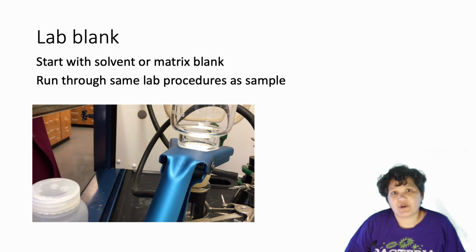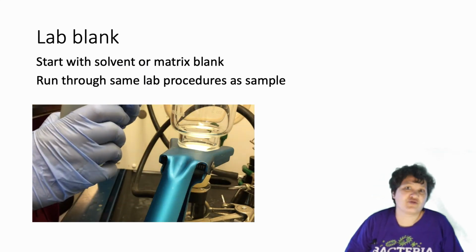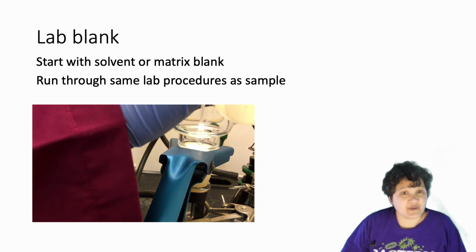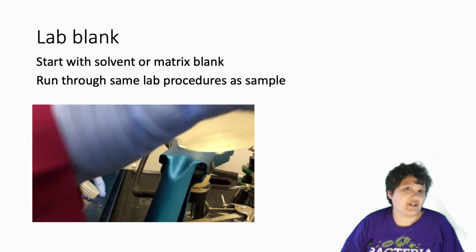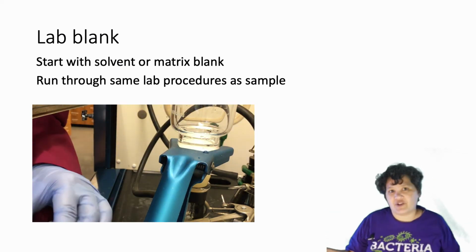And that step might add contamination. So in this case, the purpose of your lab blank is to test whether the filtering process introduces contamination into your sample. So you would filter it and then prepare it as you would any other ICP sample that you picked up from a stream or whatever.